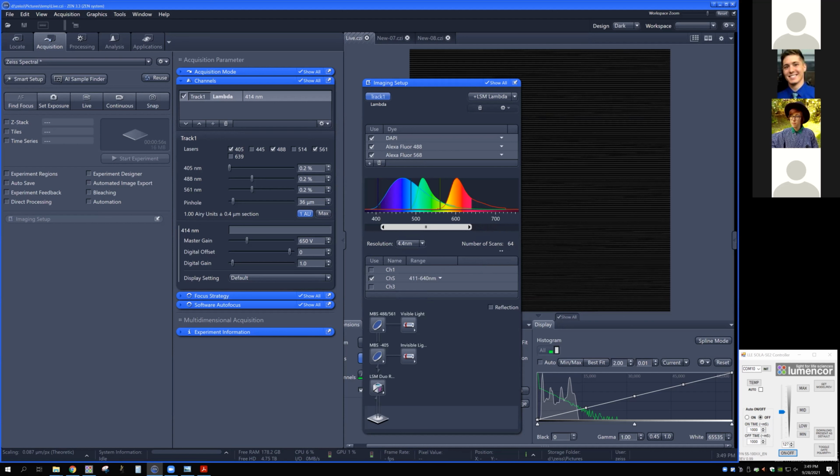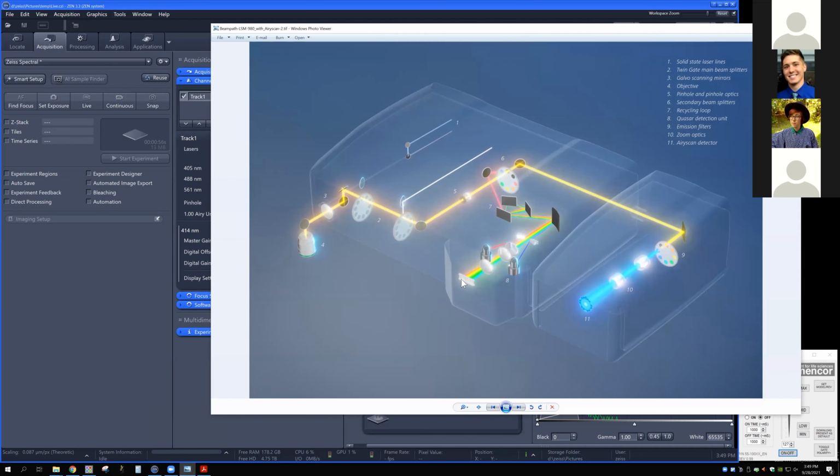The reason for this is that now we're not relying on the spectral detector to naturally separate things into that 8.8 nanometer bin, but we have to go back to these prism elements and these stops to send even narrower bands to a portion of each of those detectors.